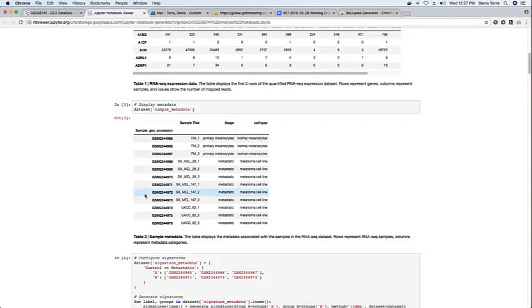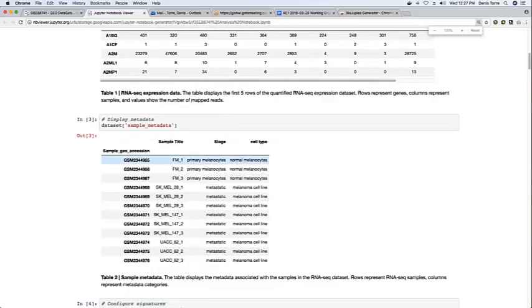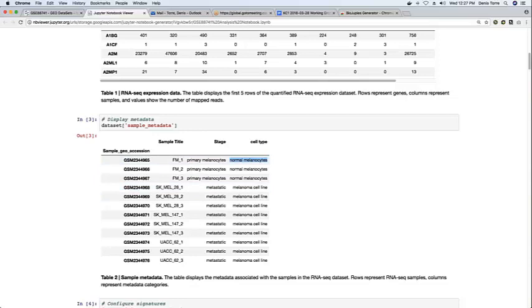We also provide information about sample metadata. So in this case, we can see the cell type of the samples. So we have normal melanocytes and metastatic cells.